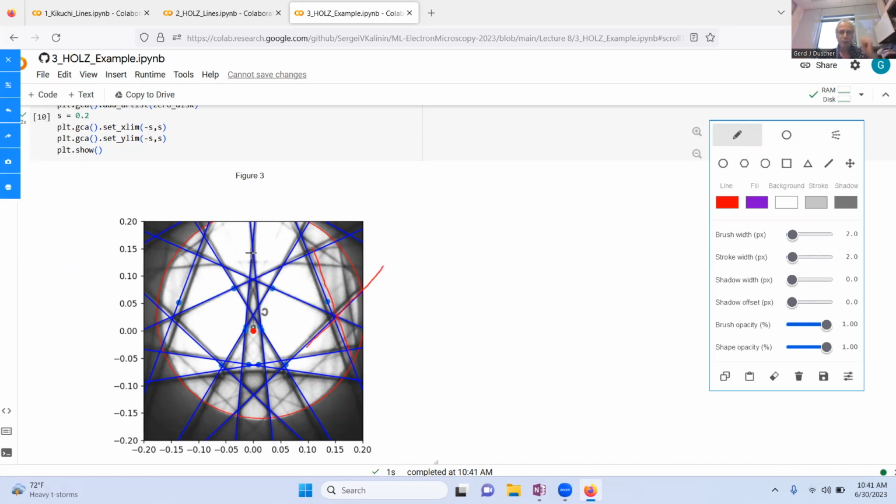Generally speaking, what people do to align that in the past is just looking at these crossings here. And these crossings are perfect. However, the higher ones out here are not. And you can see how they are deviating a little bit, and over here as well. So the higher angles are not perfectly done. So let's see what the problem is and whether we can fix it.